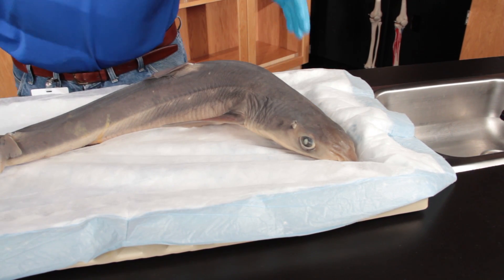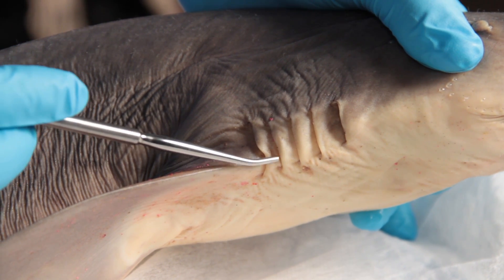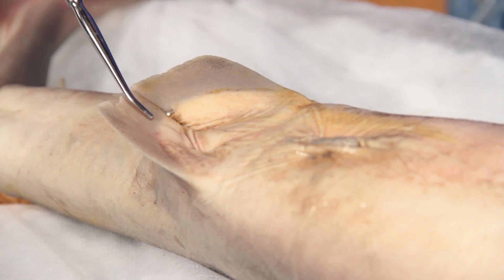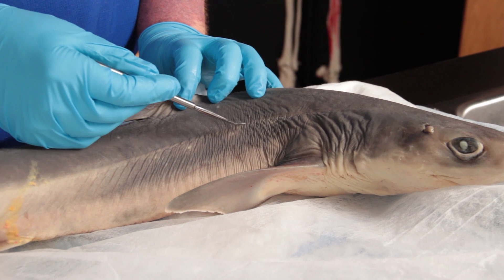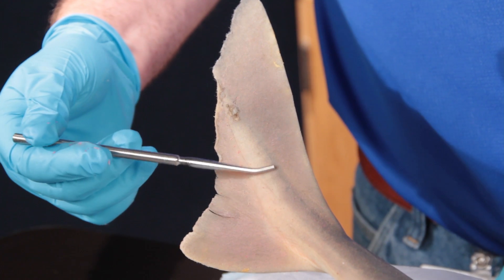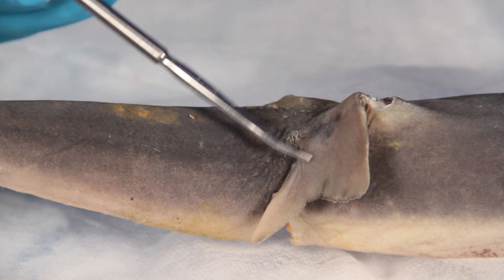Lay the shark dorsal side up. Identify the external organs including the gill slits, pectoral fin, pelvic fin, lateral line, caudal fin, and posterior and anterior dorsal fins.